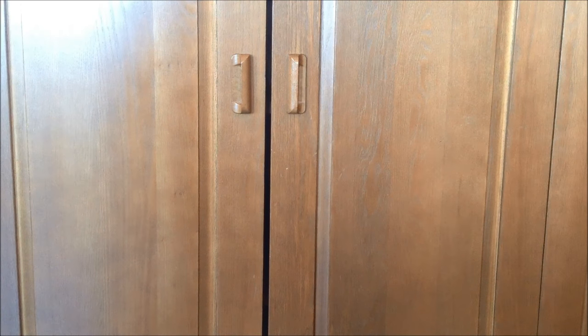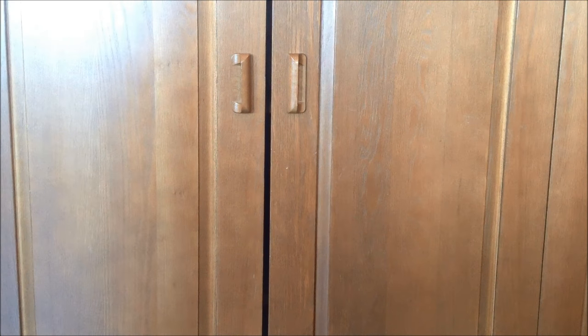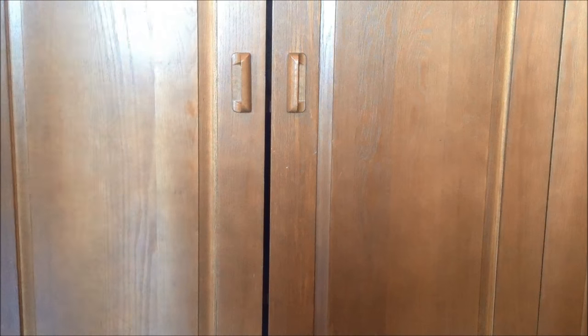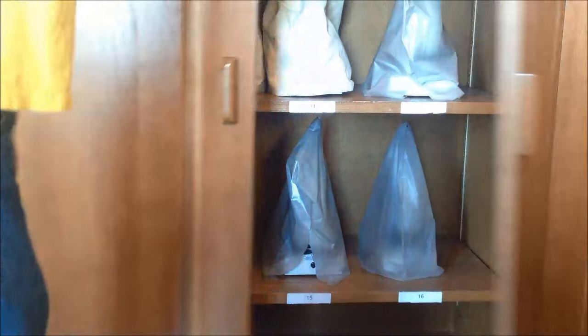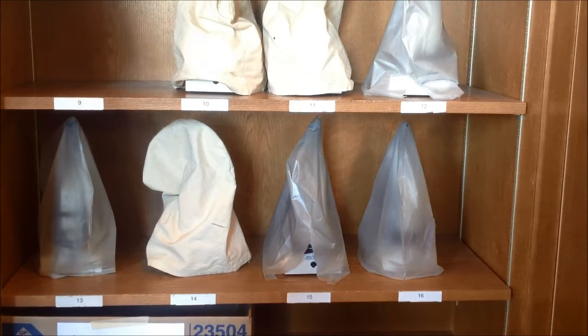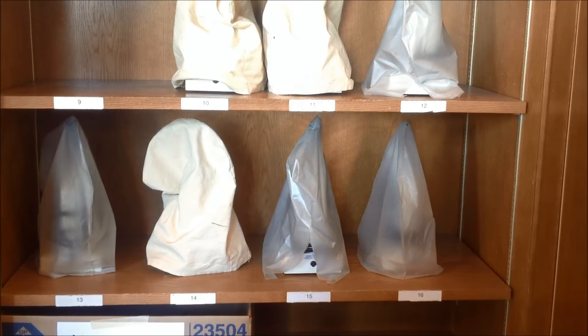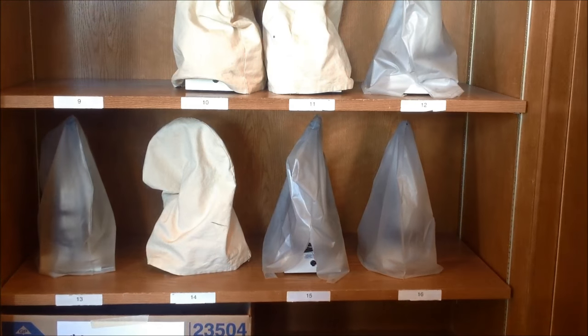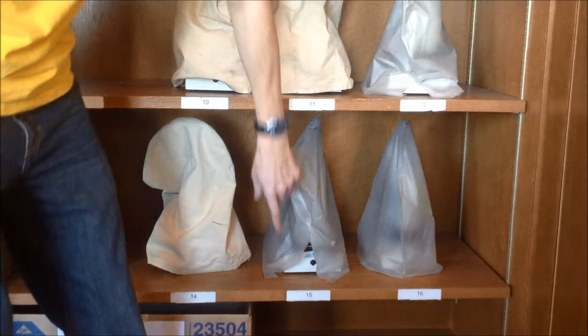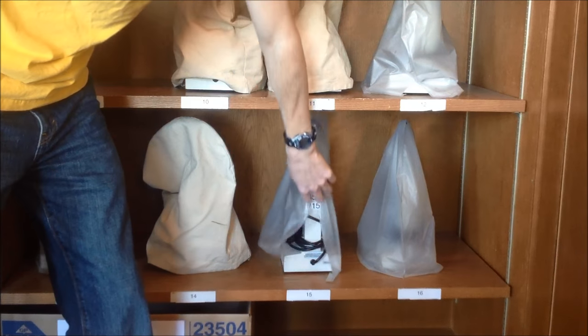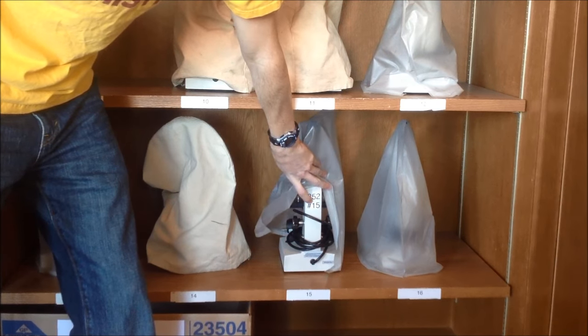So the microscopes are all in the back left hand corner of the lab and cabinets labeled microscopes. And I'll actually open up one of the cabinets here and you can see that each microscope has a particular number associated with it as far as where they are located. And you can actually very easily identify the spot with a number and the microscope with the accompanying matching number.